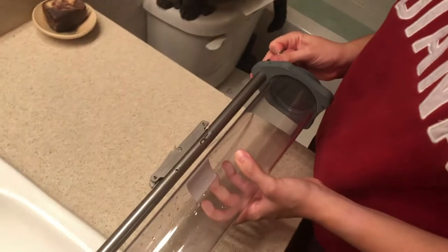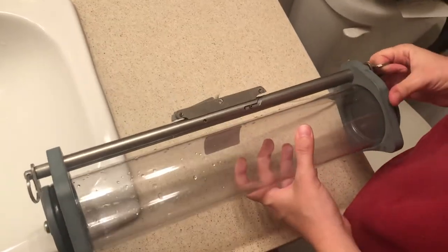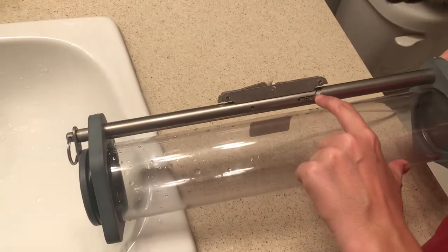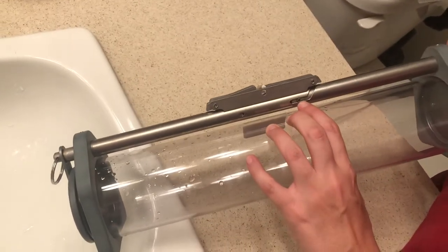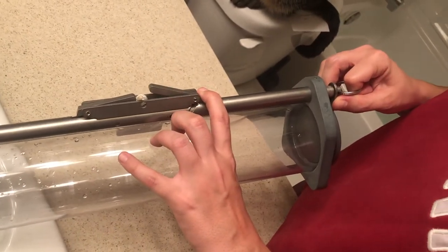I'm going to show you how to use the horizontal water sampler. Let's put it on the counter first. There are a couple of different parts that are important. This right here is called the pin, and it's in the channel — it moves back and forth if you pull this sidebar out. And then this is the trigger.